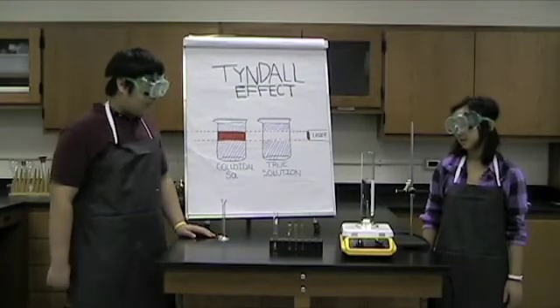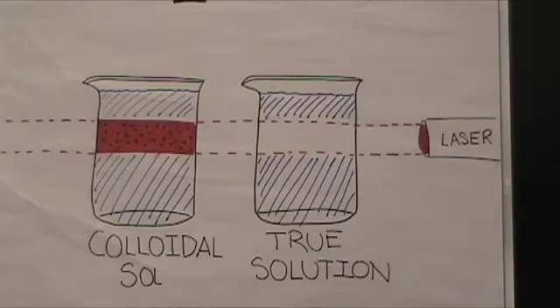It helps me identify a colloidal solution. A colloidal solution is when there's solid particles suspended in a liquid and the solid particles are too small to sink to the bottom. They reflect the light from the laser, thus showing the beam in the solution.